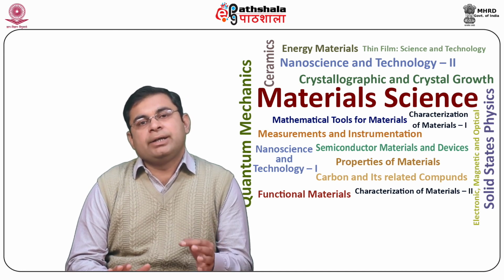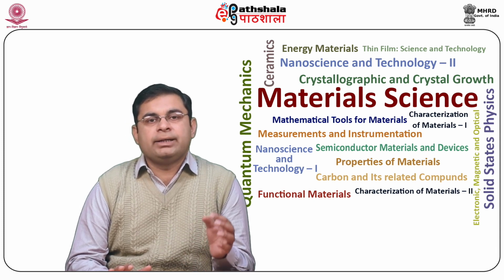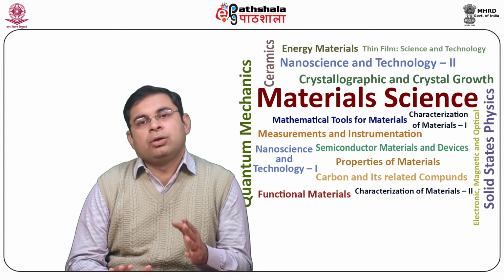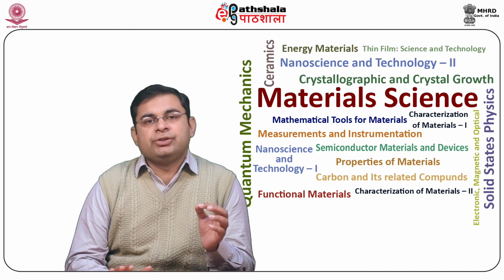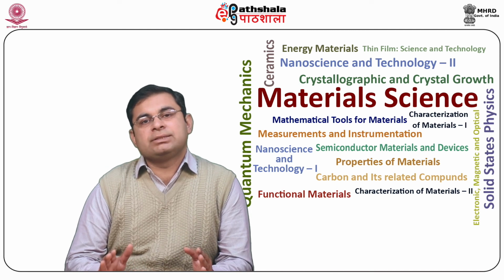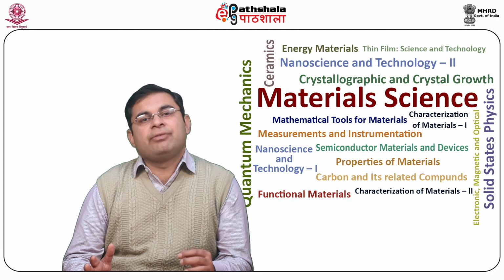CMA has a high transmission efficiency, compact size, and is simple to use, making it suitable for Auger spectroscopy. CHA is used for Auger spectroscopy whenever a chemical state analysis is performed, since it has higher resolution.